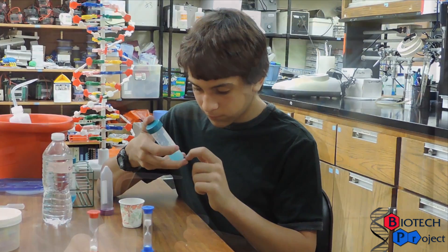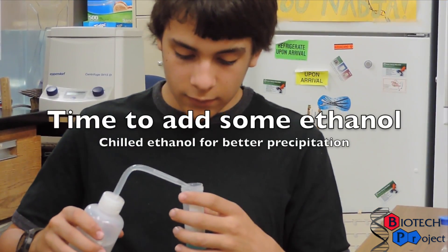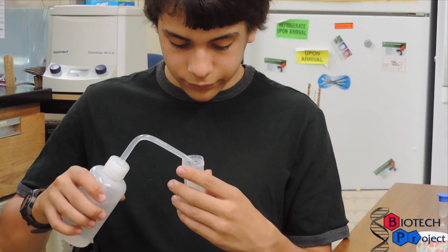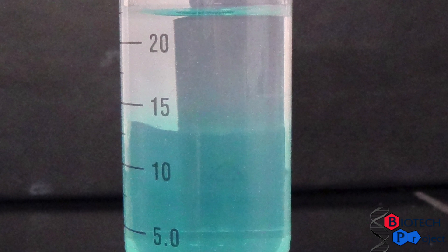Can you see our DNA? Not yet. We add chilled ethanol to make our DNA precipitate. DNA doesn't like to be dissolved in ethanol. When the DNA comes into contact with chilled ethanol between the two layers, DNA comes out of solution and wicks out.